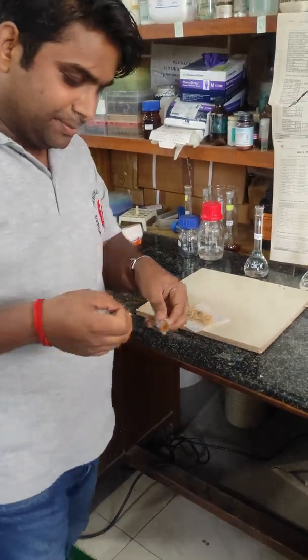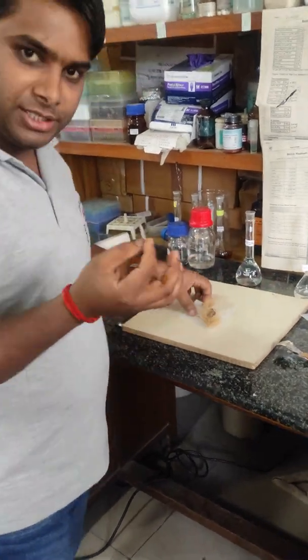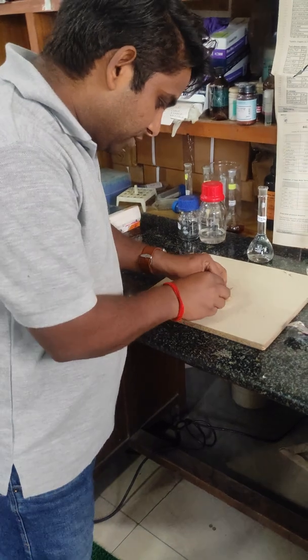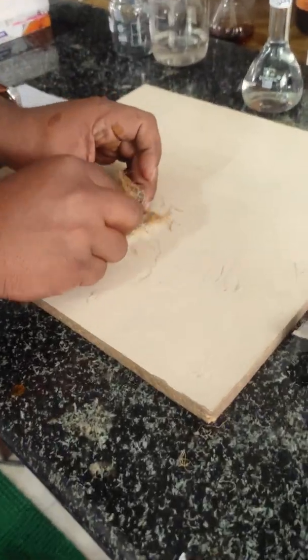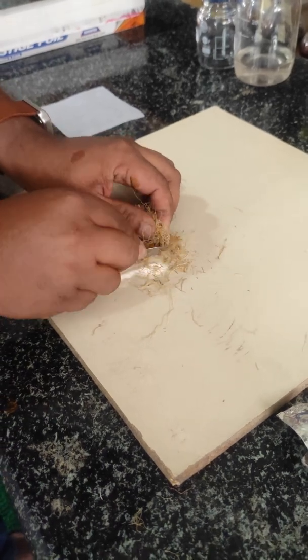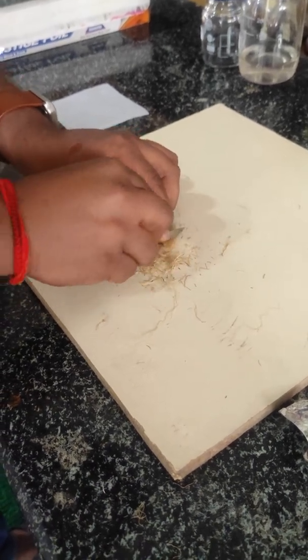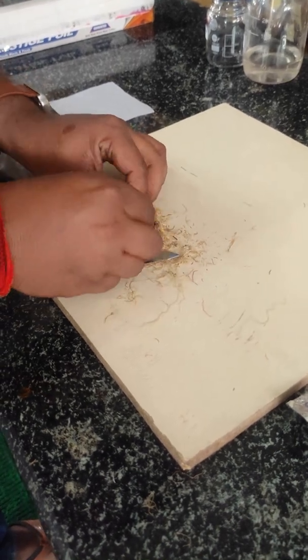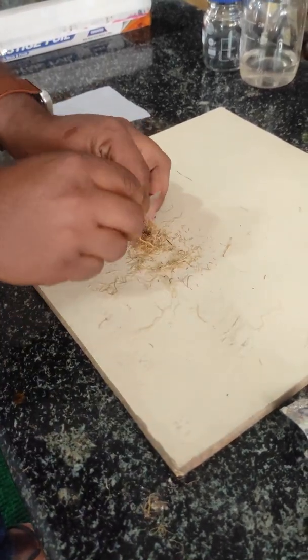Now the second step is to cut the thallus into small fragments. Now I am going to cut the thallus into small fragments. See carefully what I am doing. You can cut the thallus using any tool. I am using a blade.